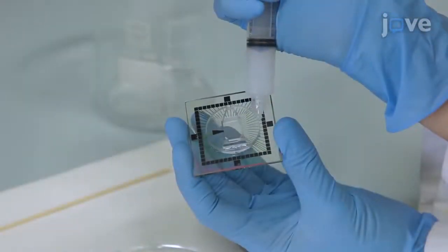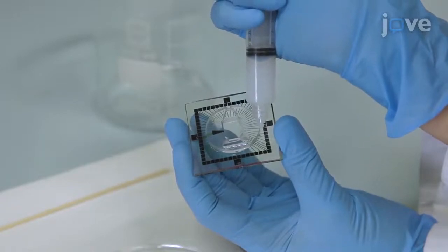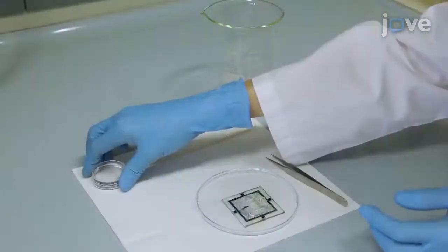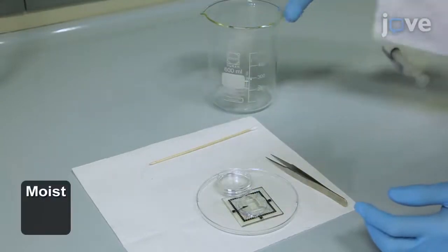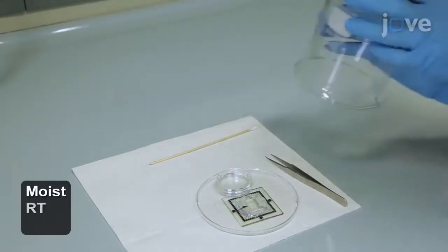Spread a sealant layer around the outer border of the recording chamber. Then place the MEA chamber assembly in a closed moist environment and let it cure at room temperature overnight.